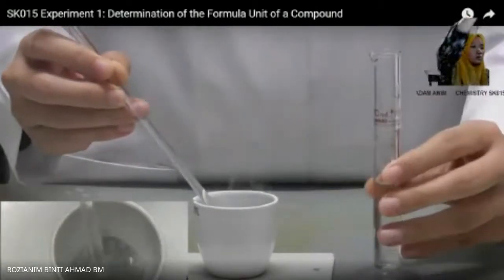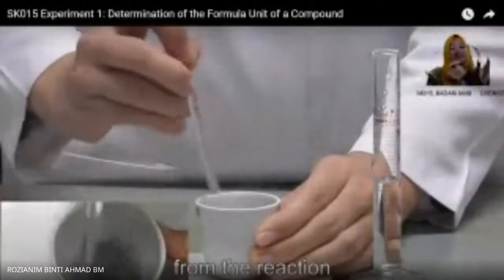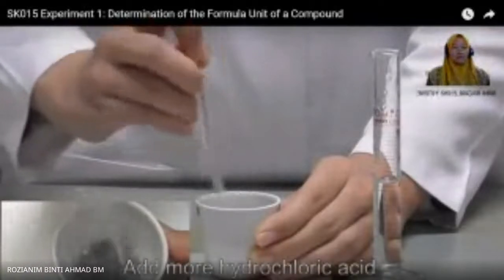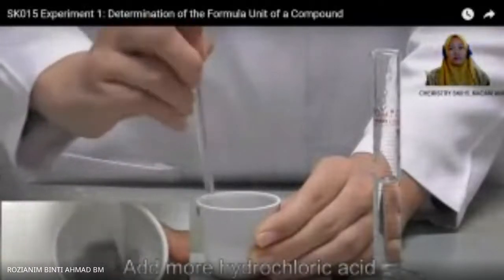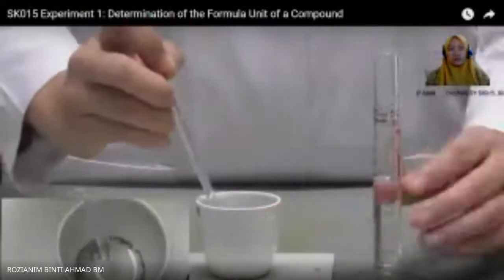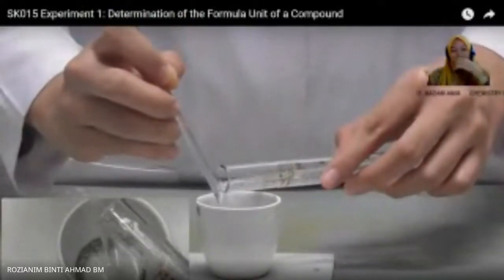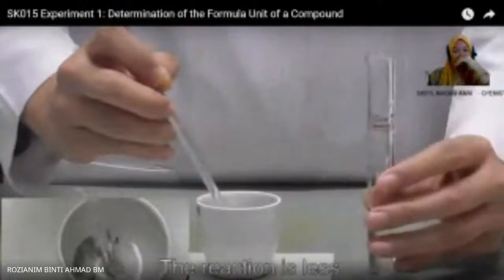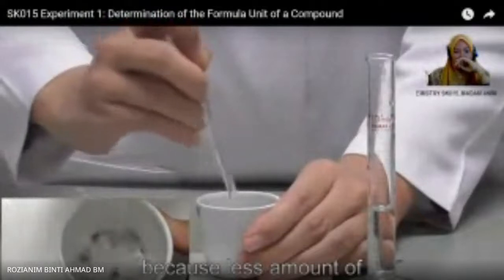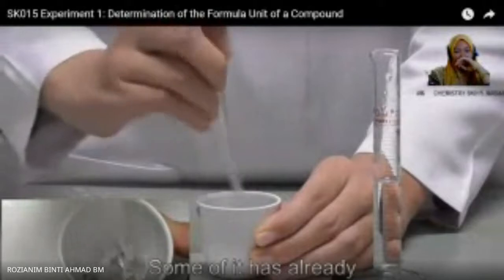Hydrogen gas is liberated from the reaction of zinc and hydrochloric acid. Add more hydrochloric acid and keep stirring until all zinc has dissolved. The reaction is less vigorous than before because less amount of zinc is left in the mixture. Some of it has already changed to zinc chloride.